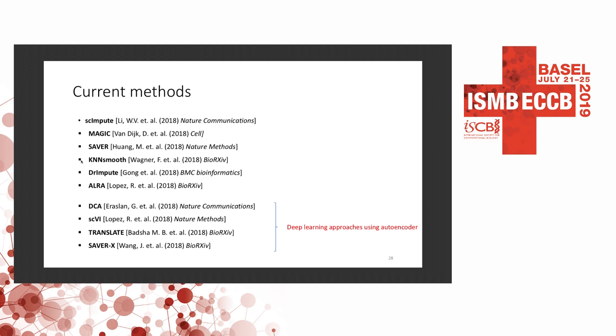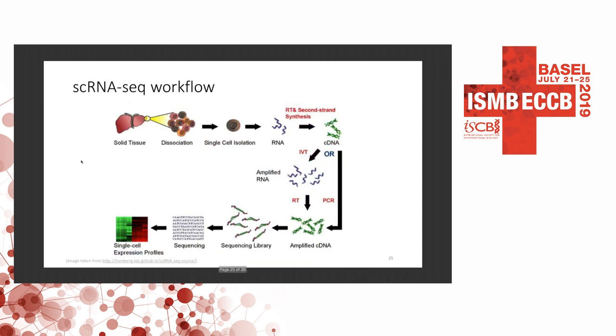Say you have 5 copies in the cell, and it's actually very hard to measure them. So what people do, let me turn to this page. Here, say you have 2 copies. Then the RNA is first reverse transcribed into cDNA, then they amplify it so that they can sequence it better.